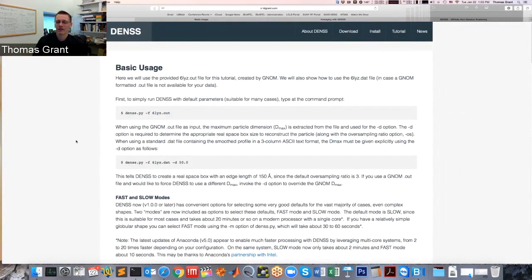So if you have something like heavy atoms in there, it's very unlikely they're going to show up, just because at low resolution they don't have enough of a density difference relative to the other low resolution regions. Whereas if you had something that was a large collection, like a gold nanoparticle attached to DNA or something, that'll show up. But some single atom like that generally won't show up.